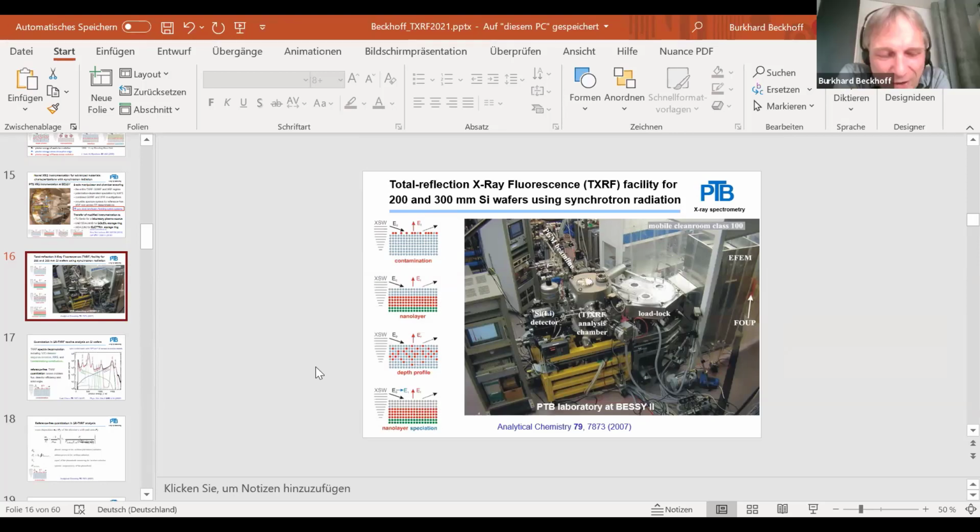Thanks a lot. You're a very accurate observer. This is the old photo. So we started with Si(Li) detectors, and for the soft X-ray work, we had thin window Si(Li) detectors without supporting grid.